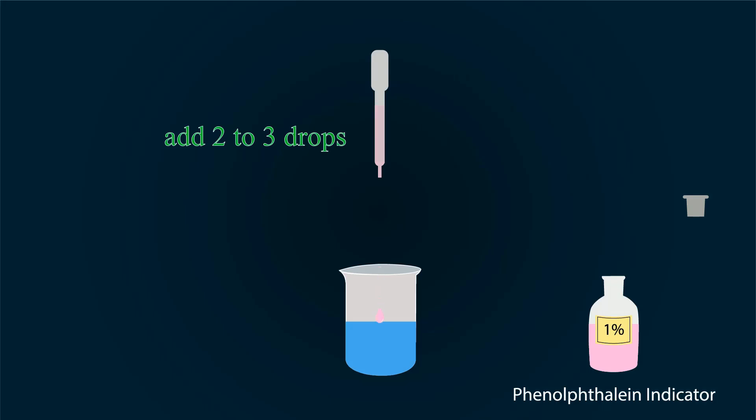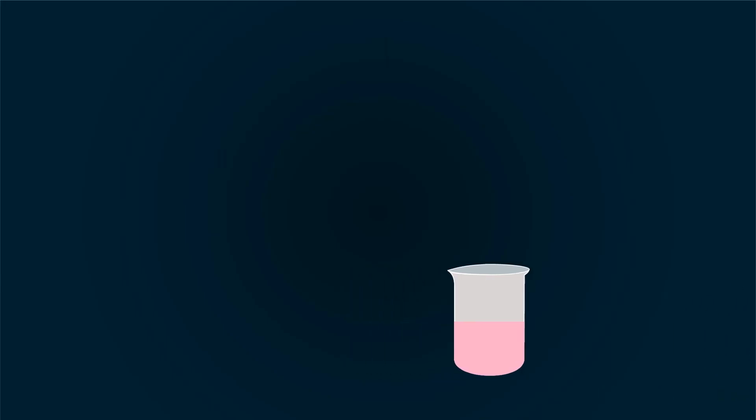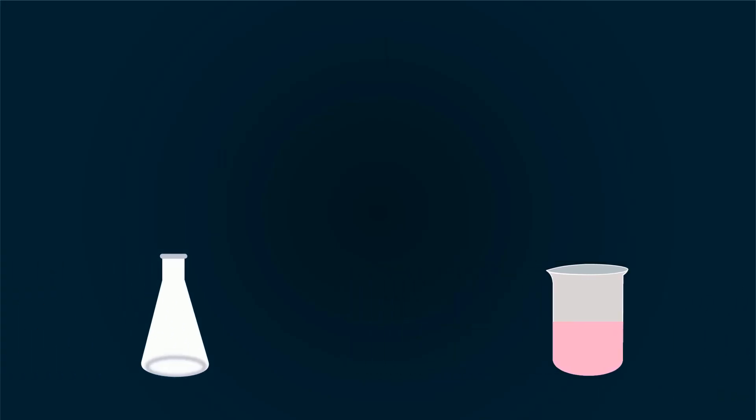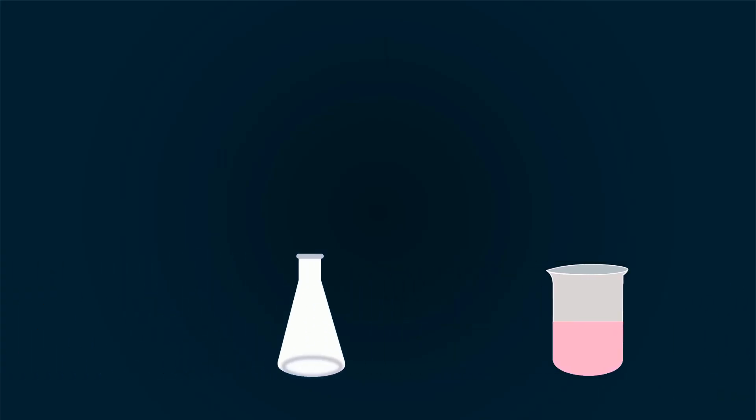The water color will be changed into pink. If the color remains the same, that means alkalinity is zero. Our water turned into pink. Now pour this into the conical flask.